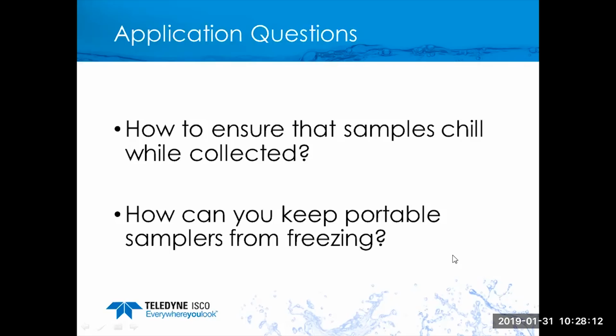If needed, there are active heating options that can be considered. They need not be any high wattage, 1500 BTU heating systems, because all we need to do is keep the sample at 33 degrees or above. Wrap insulation or heat tape, if necessary, around the suction line that's exposed to prevent little droplets of water from freezing and building up in the interior of that line.